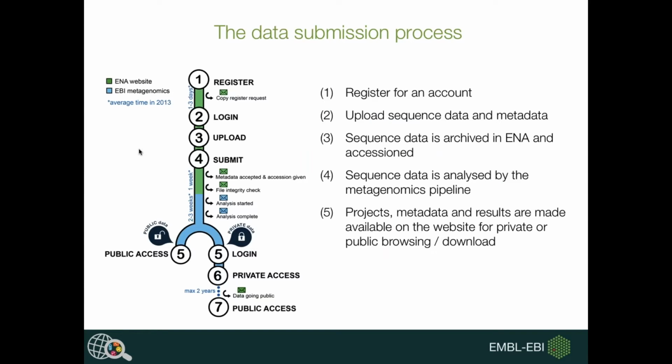So just to take you through some of the process, if you wanted to submit data to us, the first thing you have to do is register for an account, and then you would upload your data and your metadata. This goes into the European Nucleotide Archive. That can sometimes take a couple of days while files are checked to make sure they're not corrupted and to get accession numbers and so on.